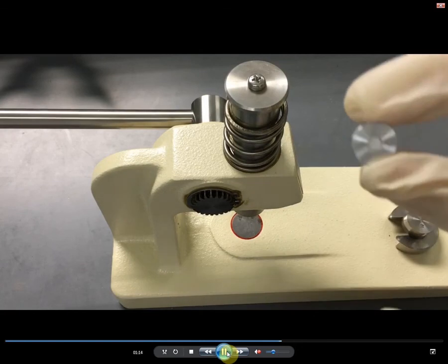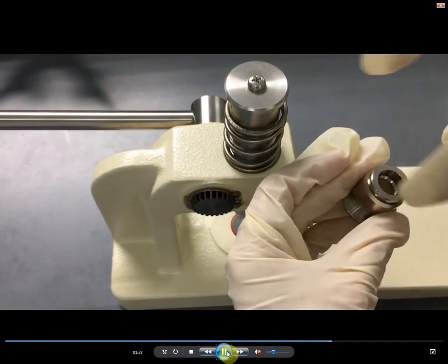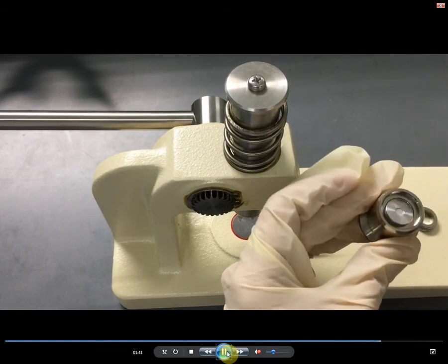This is how the frame with the sample disc should look like. Next, attach the frame to the pellet holder.